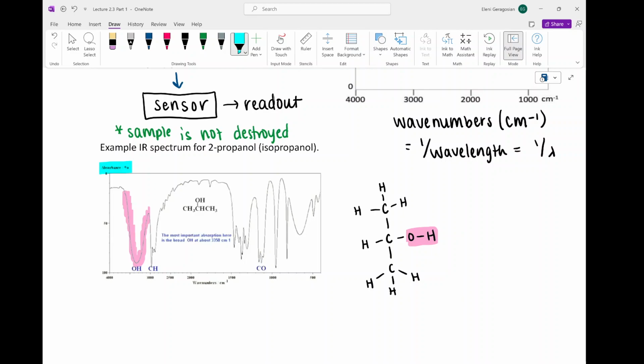That's saying the molecule did not absorb that energy. If it has a high absorbance, then the peak is lower, and that's what we see for that peak I've highlighted in pink. But it looks the same if you either have 100 down here and 0 at the top for absorbance, or you have 0 at the bottom and 100 at the top for transmittance.